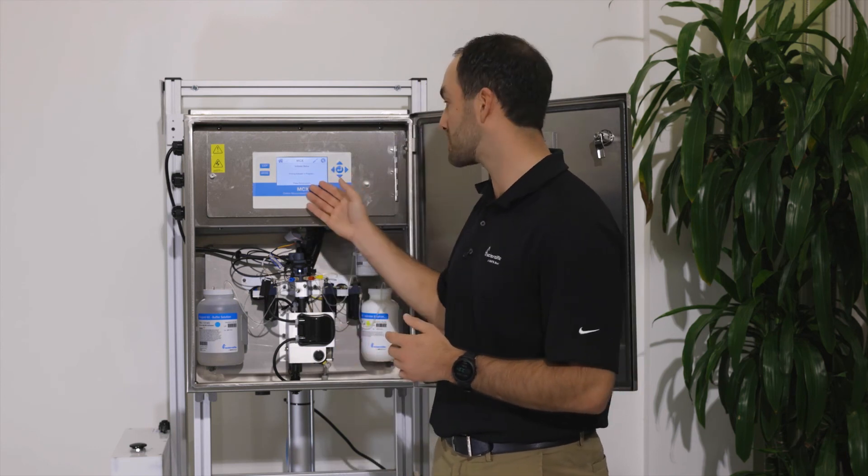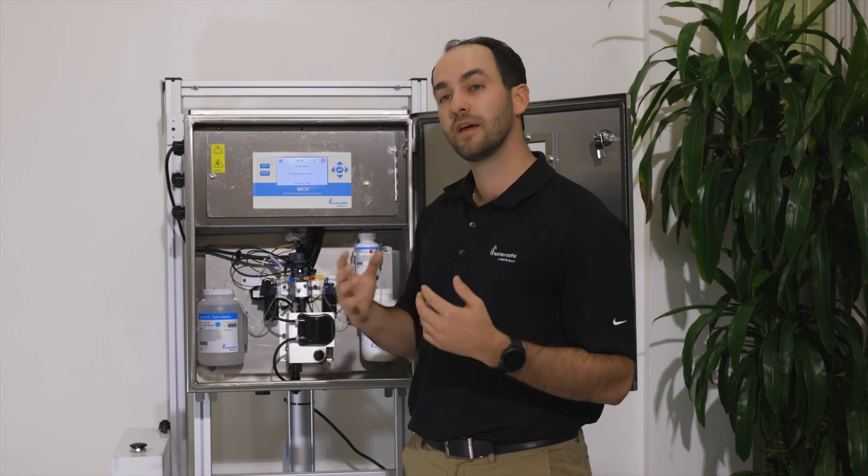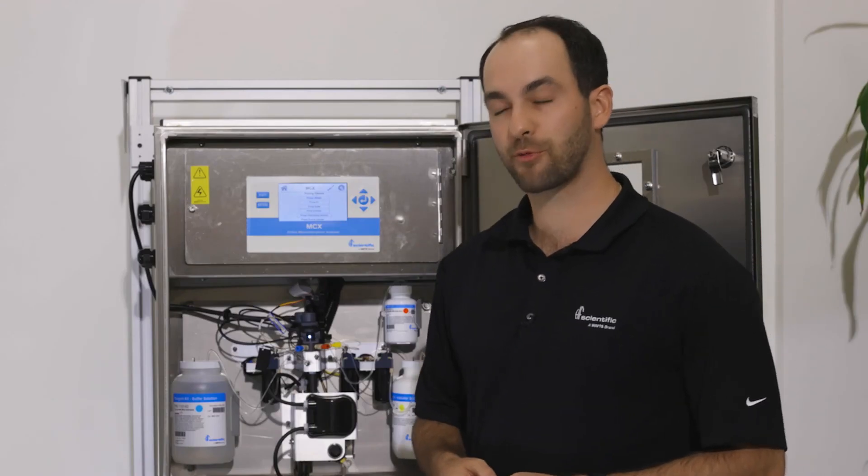So follow the same process, go to the screen, toggle down to prime, and prime the indicator again. After you have primed all three reagents, you can replace the light shield.